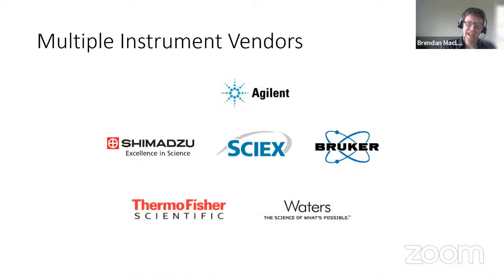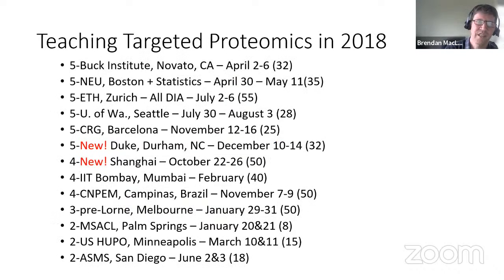From its inception, Skyline has supported 4 of these 6 instrument vendors. The other 2 came along afterwards and said, wow, we would like to be part of this group. And so they're now all funding the work with Skyline, and we work very closely with the people at these companies, and they're very engaged in making sure Skyline works with their latest advances in their instruments. So that's a really great relationship that we're happy has flourished over so many years.